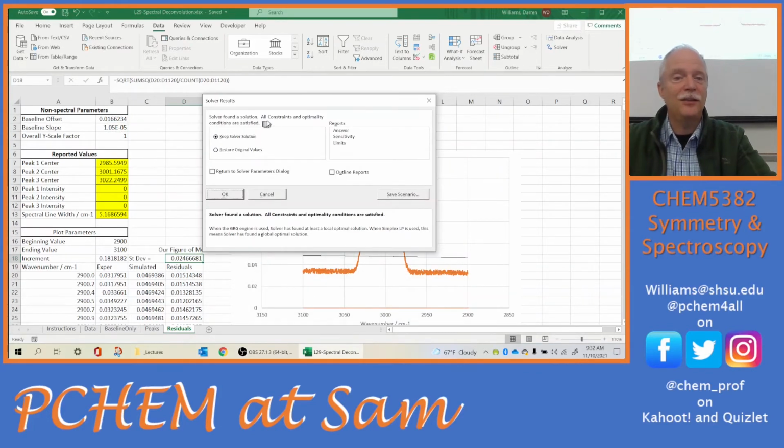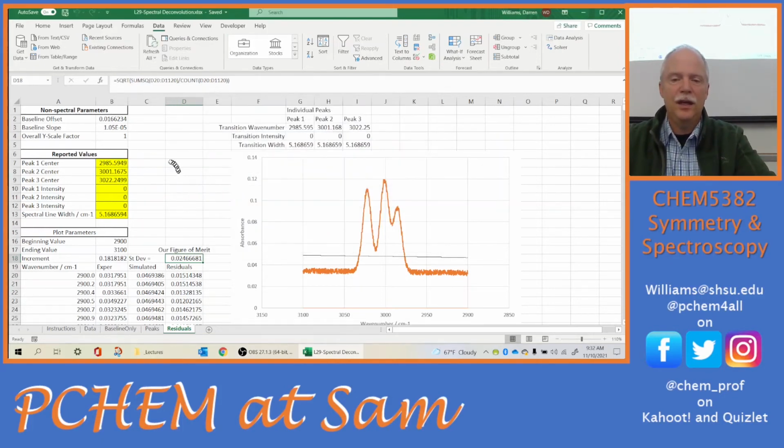It says it found a solution. Okay, yeah, because it found a minimum. But that doesn't mean it's a good solution. Okay, so we'll hit OK. And look where it put the baseline. Why did it do that? Because the average is good. Yeah, the average is good, right?